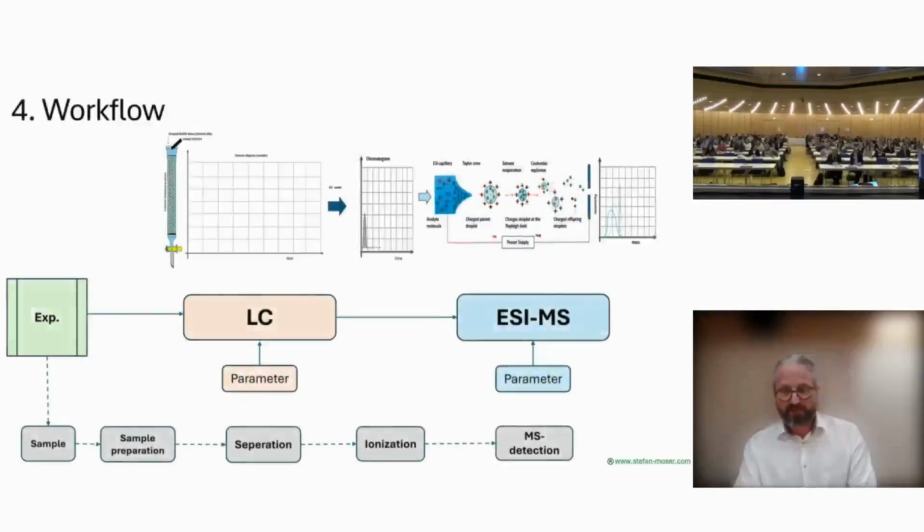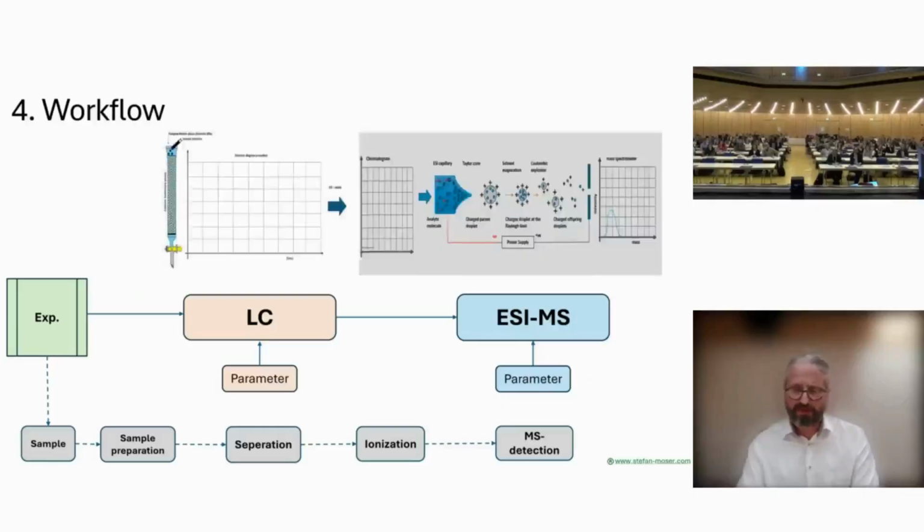Every study begins with careful planning. At ICNTS, this is done by using design of experiments, a structured approach that allows us to vary several parameters systematically. We adjust key factors such as exposure time, pharmaceutical concentrations, solvent composition, and plant tissue type, keeping them as independent as possible. Before data collection, all sampling and analytical steps are tested, optimized, and validated to make sure the workflow is stable.